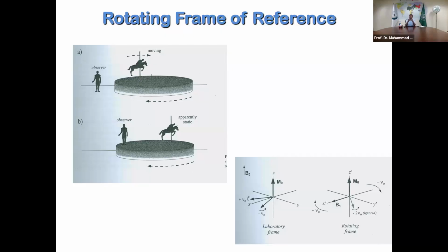And this is the second most important concept after the right-hand thumb rule of pulses, where radio frequency places them at different positions on the XY plane. Now, when they are on the XY plane, all of them, if you have 5 different protons, are moving with the speed of light, with a difference of velocity of a few hertz, not megahertz. So it's a few hertz, some of them moving faster, the others moving slower.